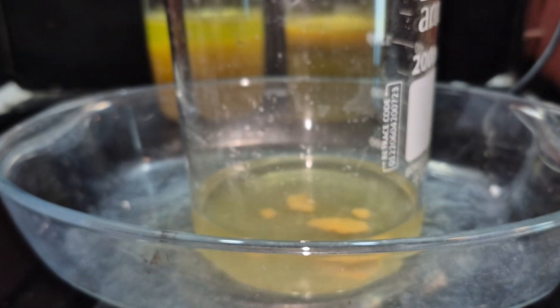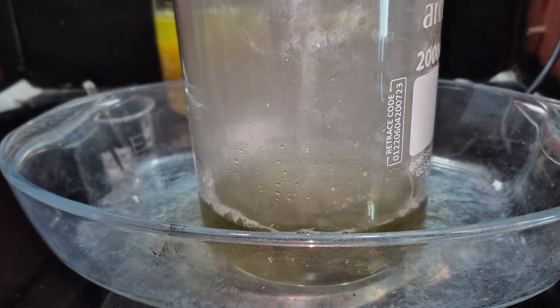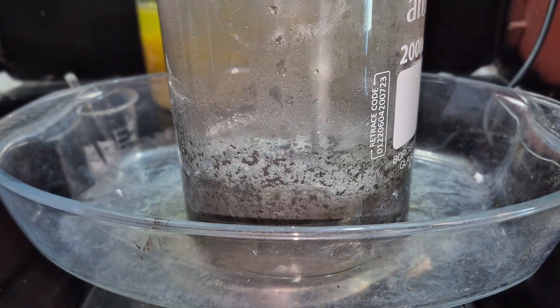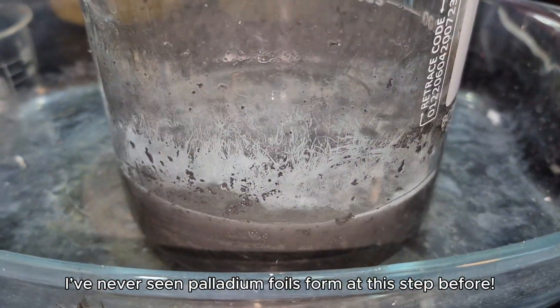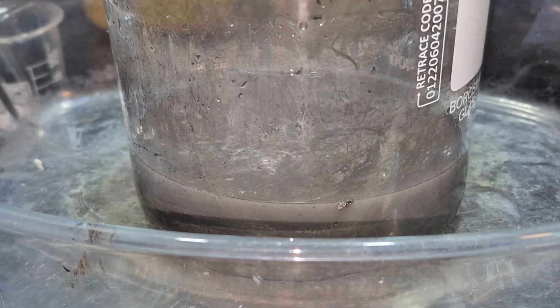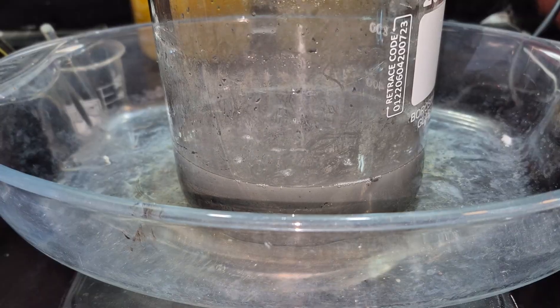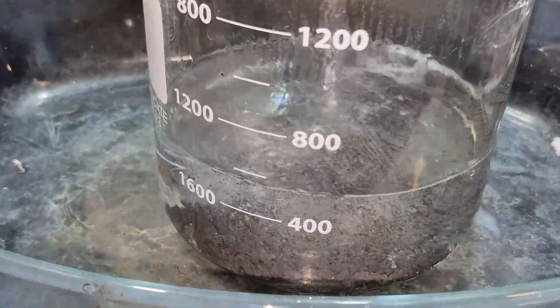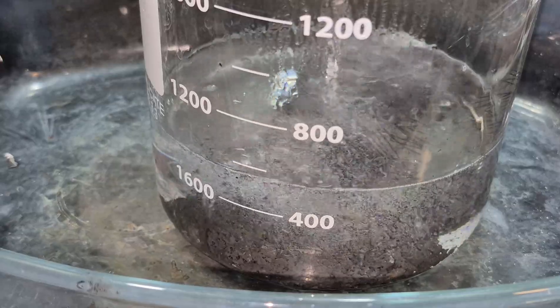I began heating the solution and then slowly added 16 milliliters of formic acid to reduce the palladium to its metallic form. I boiled the solution until all the palladium had been fully reduced to its metallic form.